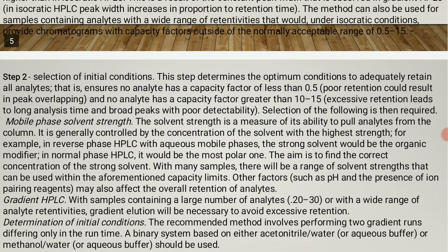Now, step number 2, selection of initial conditions. This step determines the optimum conditions to adequately retain all analytes. This is ensured when no analyte has a capacity factor of less than 0.5, and no analyte has a capacity factor greater than 10 to 15.